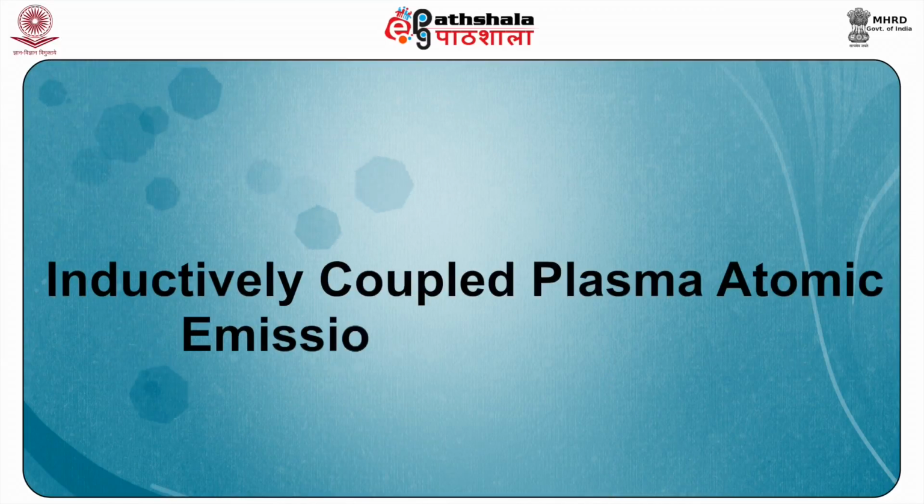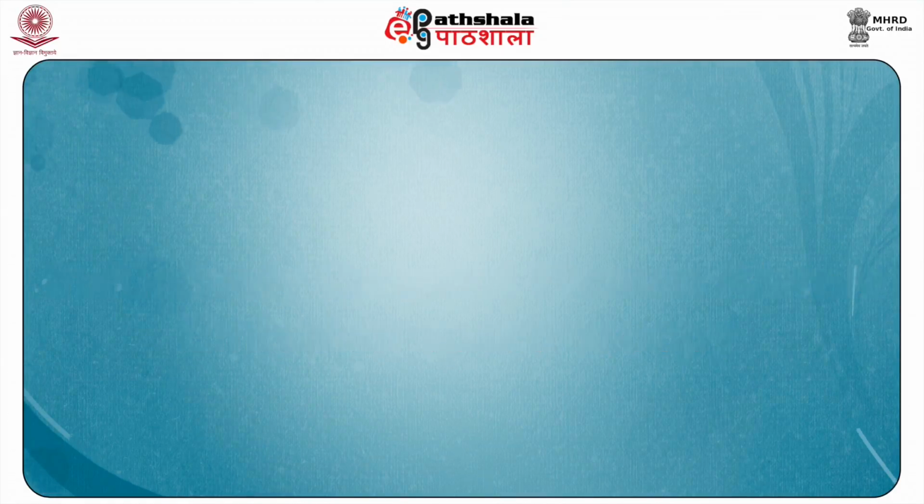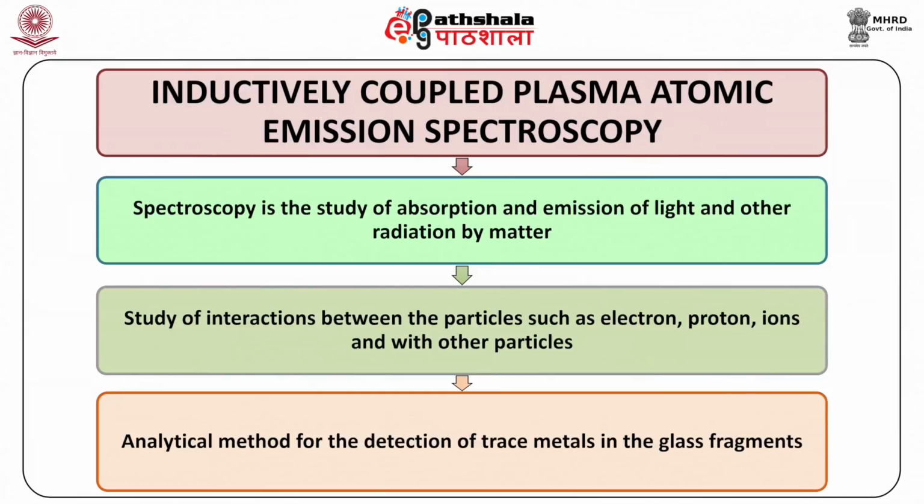Let us first discuss what we mean by inductively coupled plasma atomic emission spectroscopy. Now, by spectroscopy, we actually mean the study of absorption and emission of light and any other radiation by matter. It includes the study of interactions between particles such as ions, protons, electrons, and other particles as a function of their so-called collision energy.